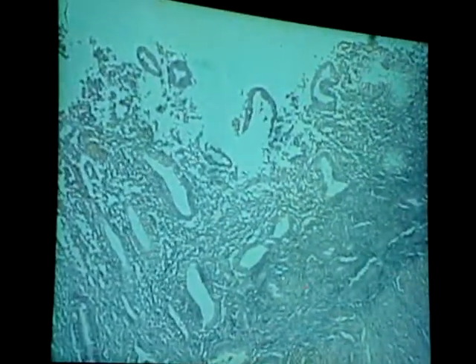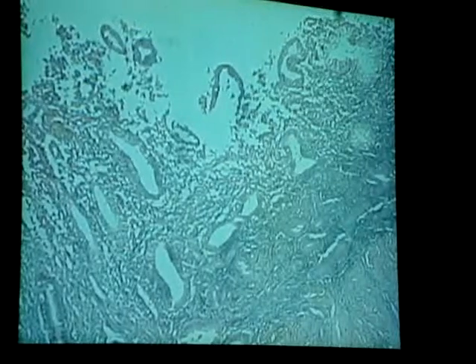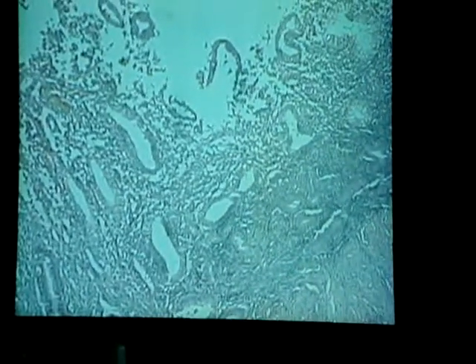All right, again, you can see it's clearly being taken apart here. That's another way to tell that this is the menstrual phase, because there's actual removal of tissue. So all that space up in here.